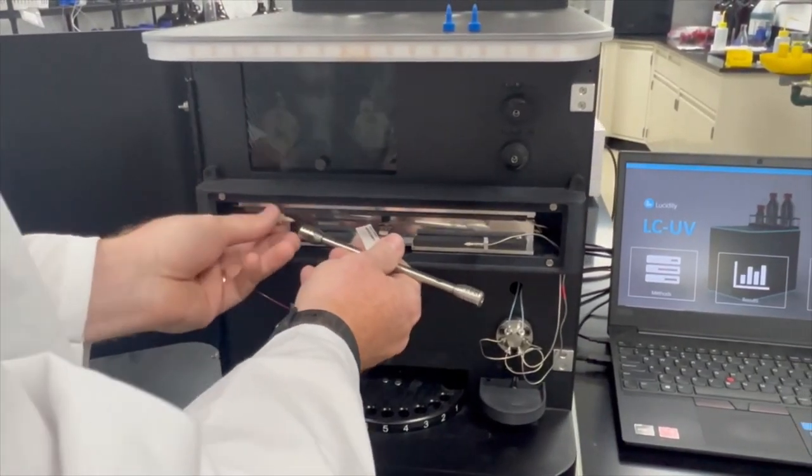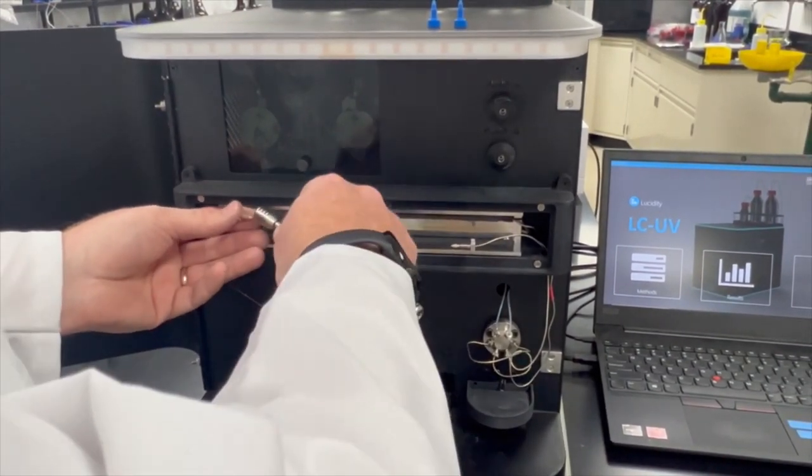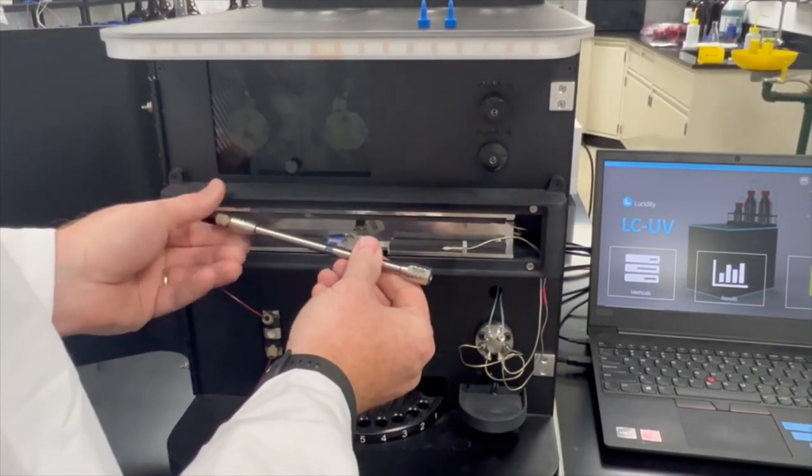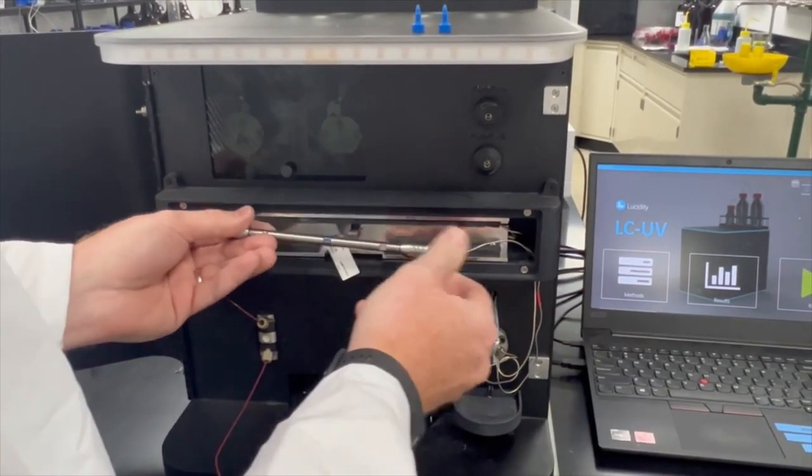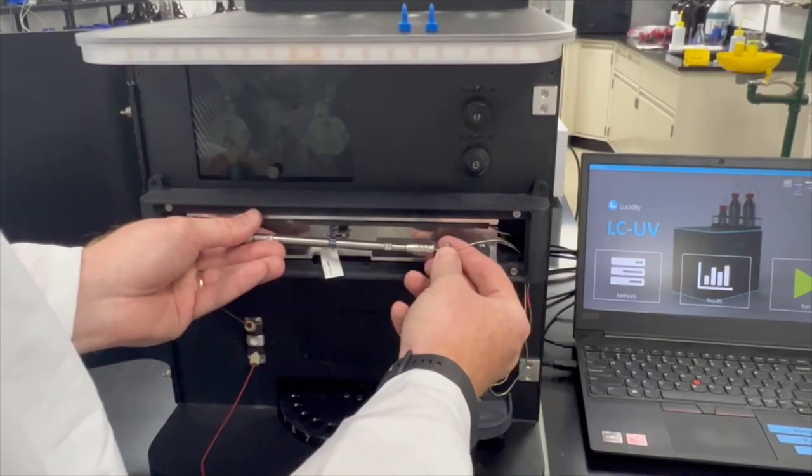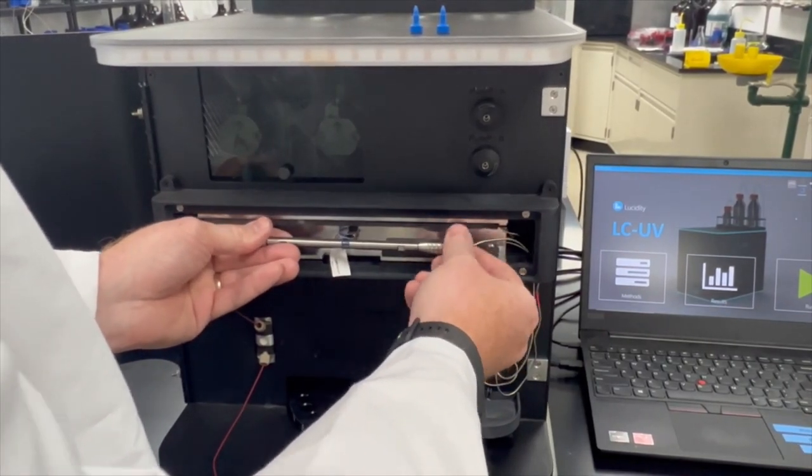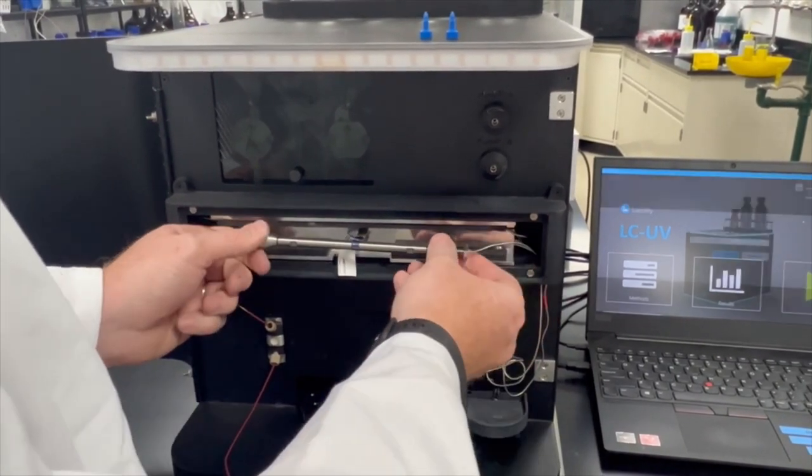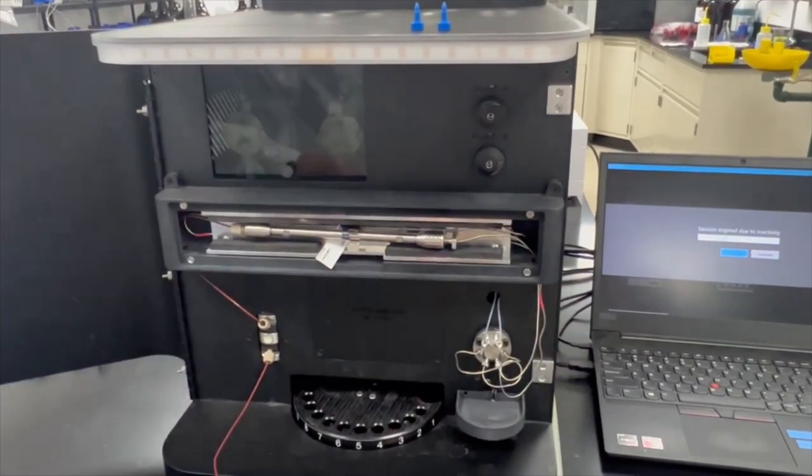We're going to connect the column, making sure the flow is going in the correct direction. We have finger tight fittings so you don't have to use a wrench if you don't want to, and then that clips right in place.